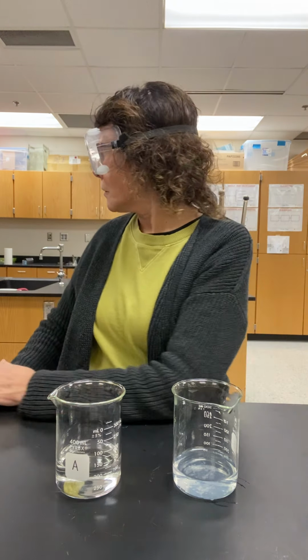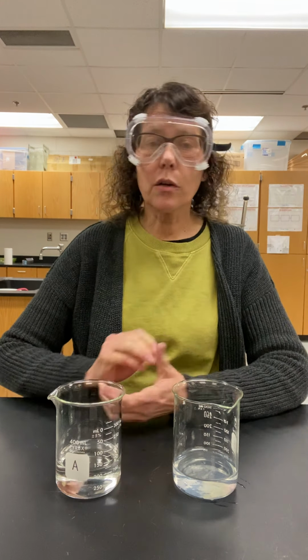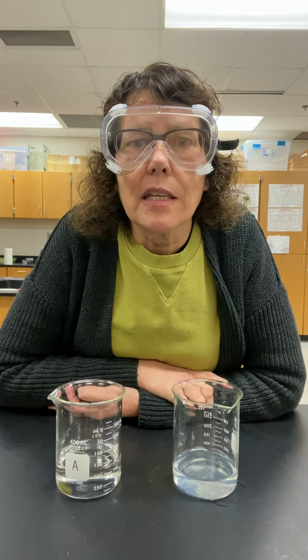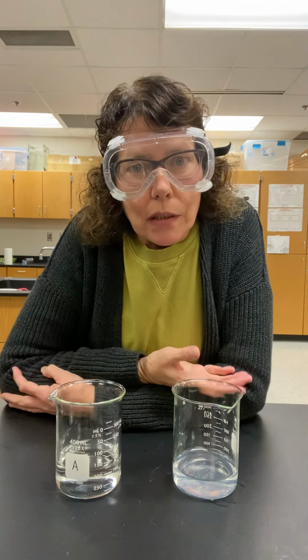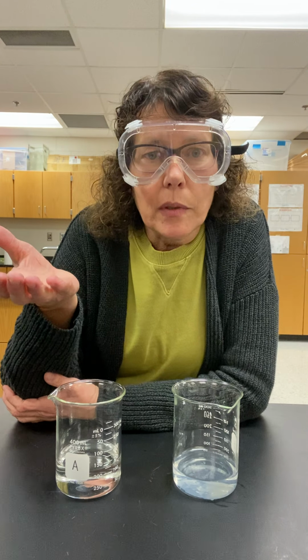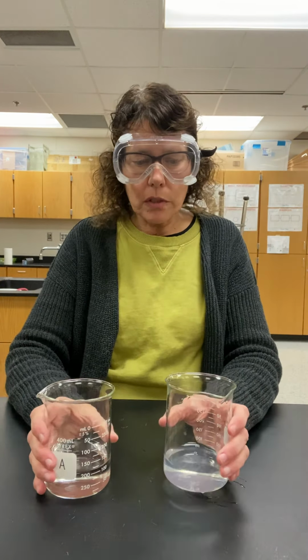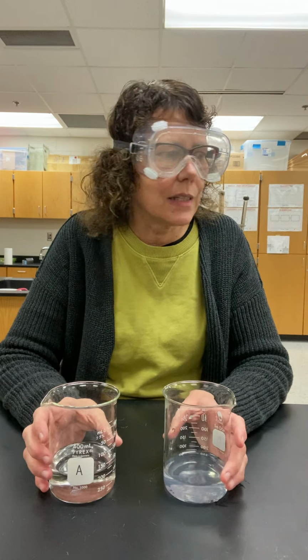The other solution, which I didn't bring the container with me, is called potassium iodate. That might be even a little bit easier to pull out the names of the elements. Potassium is an element and iodine is an element. All right, so I got two different solutions here and we're gonna watch some surprising stuff happen.